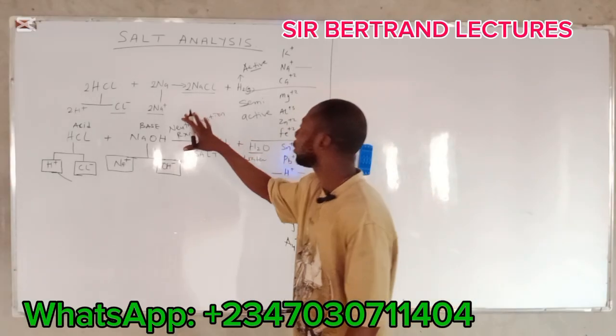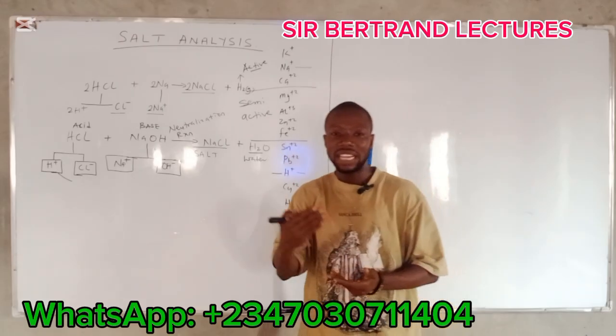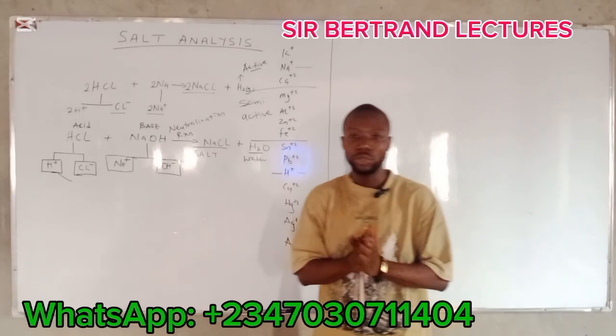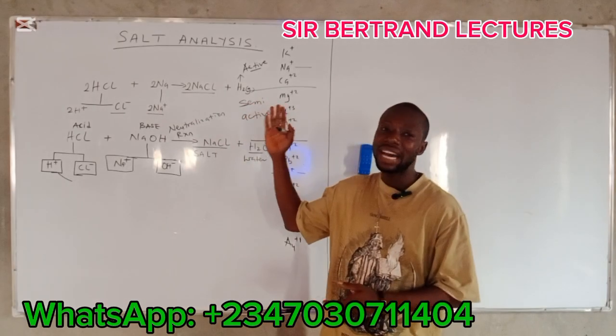Now, the topic we're going to discuss here is salt analysis. We are going to analyze the ions that are present in a given salt sample. You have a salt, you don't know the name of the salt. Now, how can you know the name of the salt? It is by salt analysis.